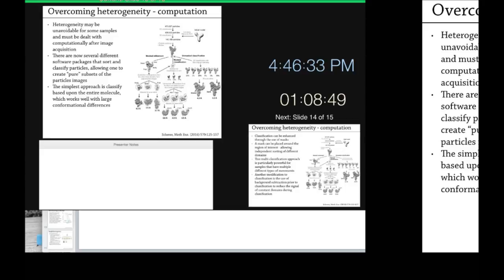One thing that I always like to do is go back and map all the particles that it thinks are junk onto my raw images and manually look. You don't have to do the whole data set, but if you do 20 or 30 images and the things it's throwing away actually look like good particles to my eye, then I skip 2D classification entirely.